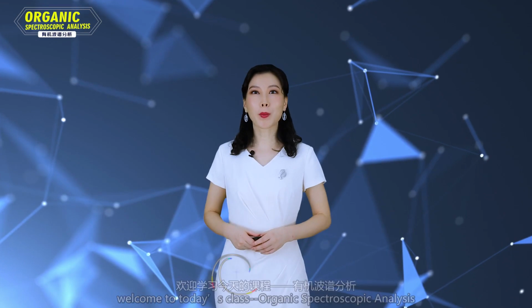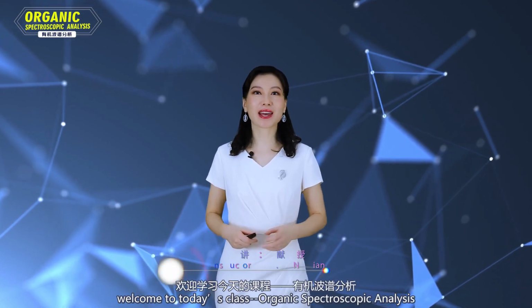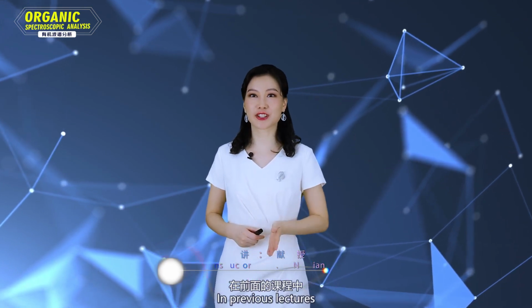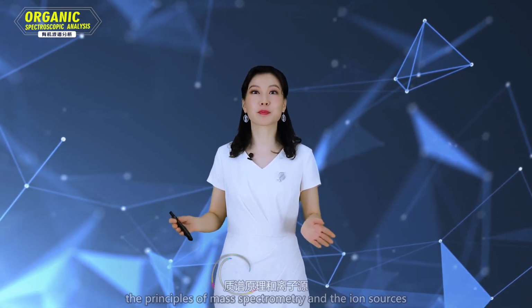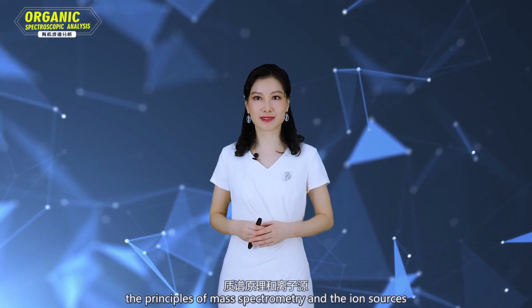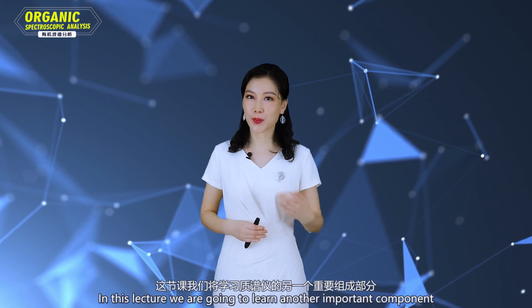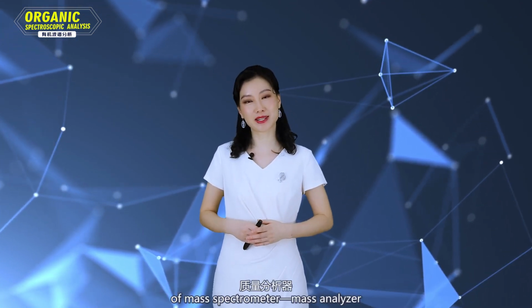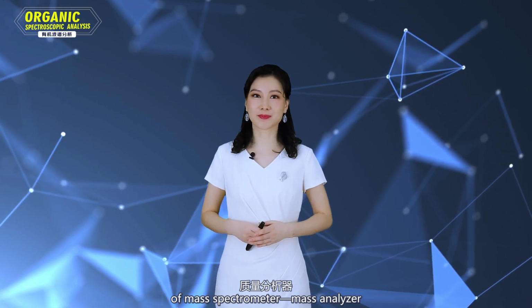Hello everyone, welcome to today's class, Organic Spectroscopic Analysis. In previous lectures, we have learned about the principles of mass spectrometry and the ion sources. In this lecture, we are going to learn another important component of the mass spectrometer, the mass analyzer.